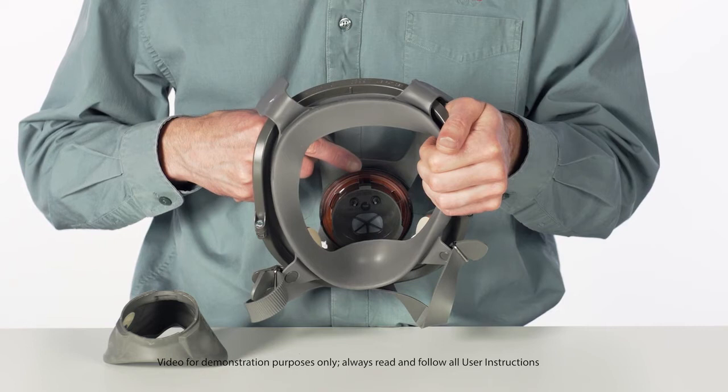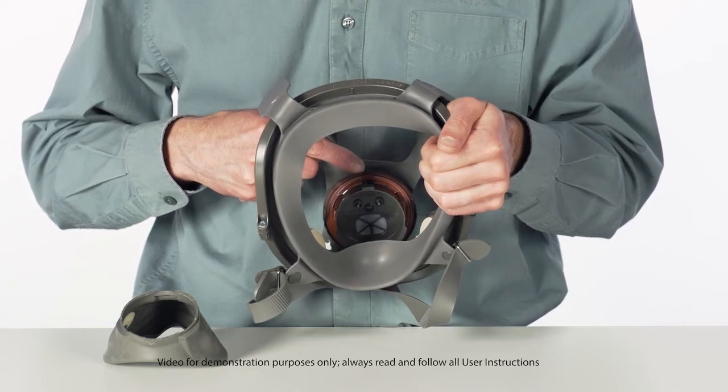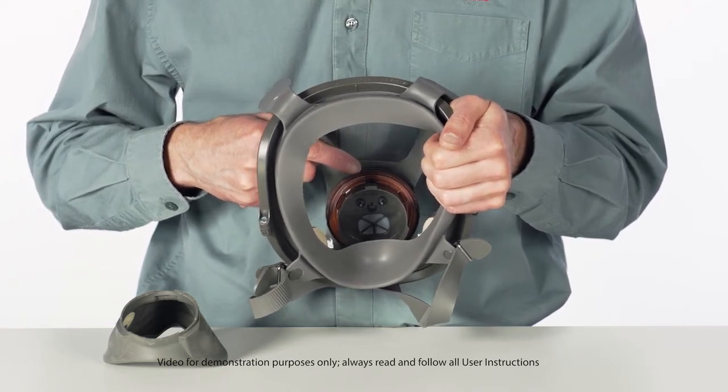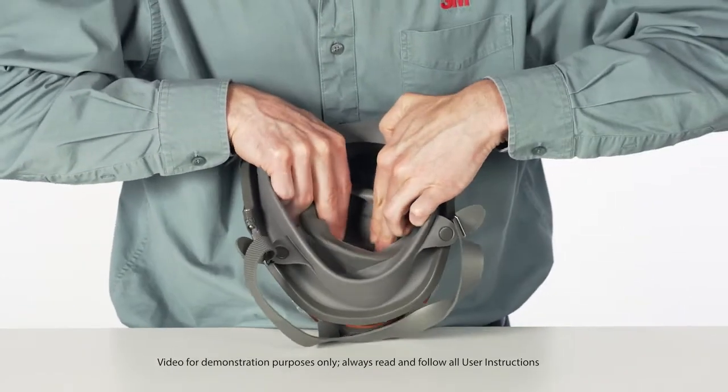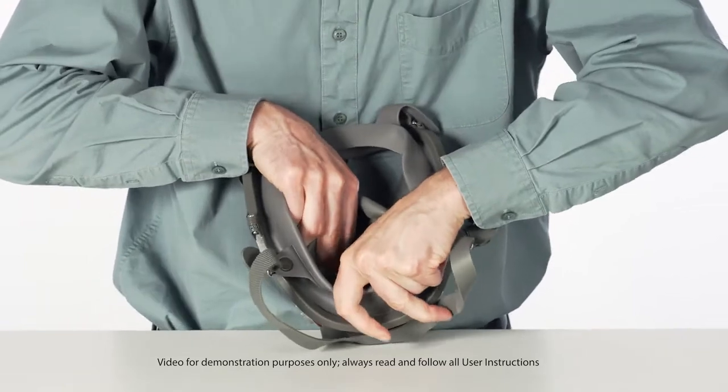Position the nose cup assembly onto the center adapter, aligning arrows. Make sure the nose cup is firmly seated under the center and side tabs.